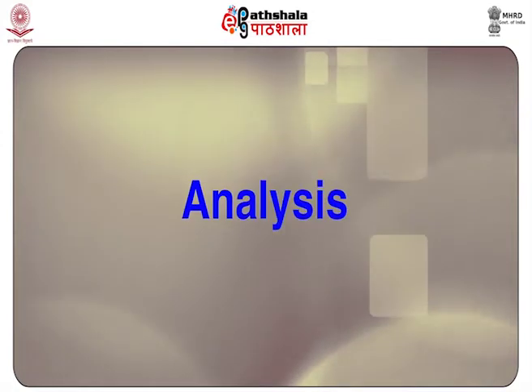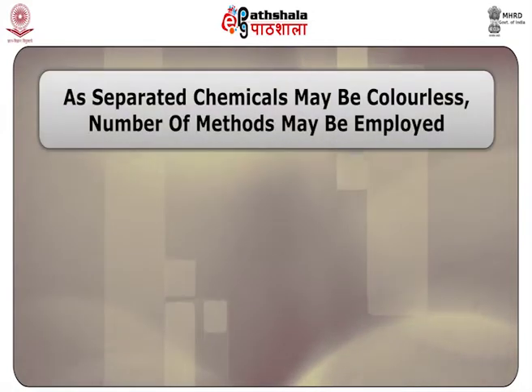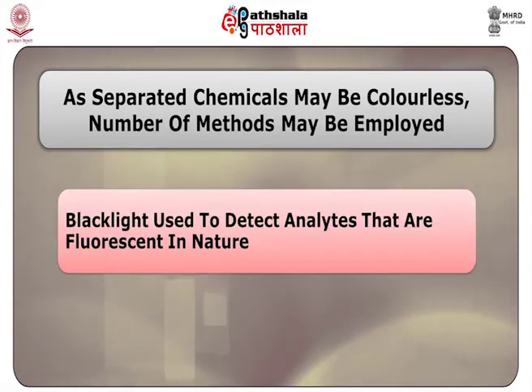Now, the analysis. As the separated chemicals may be colorless, a number of methods may be employed to visualize the spots. Black light or wavelength 366 nanometers could be used to detect analytes that are fluorescent in nature, like quinine.